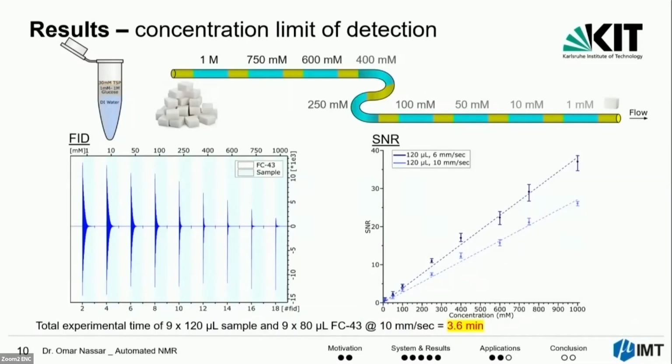So as these oil plugs are moving, they are pushing completely the whole sample. So you can see here we have an aqua sample with 1 millimole and another sample with 1 mole, and we still push the whole line back and forth, running the experiment 4 or 5 times, and they never mix together. Thank you.